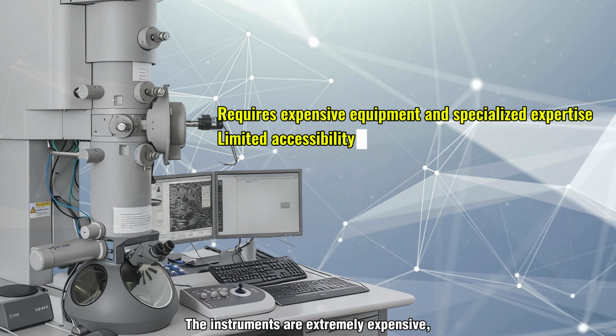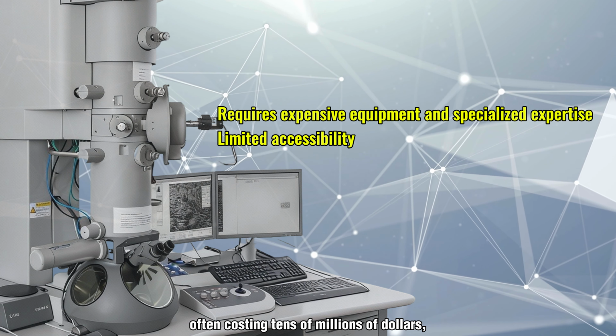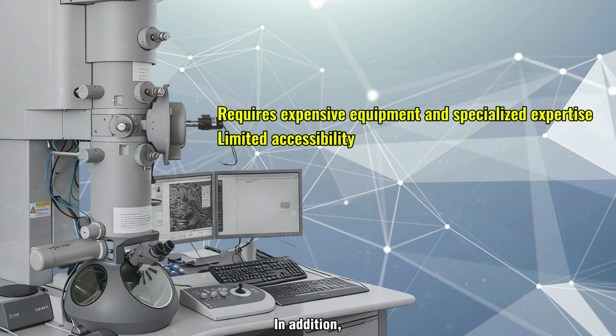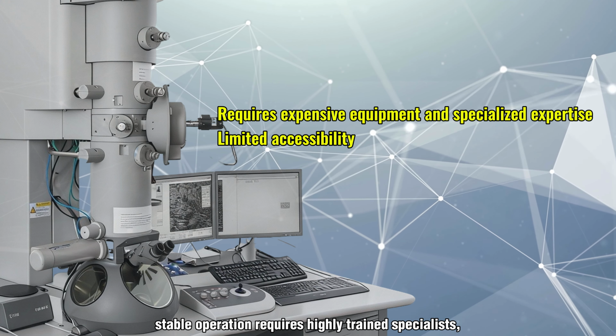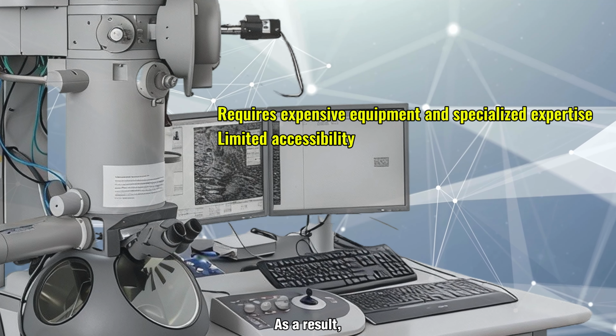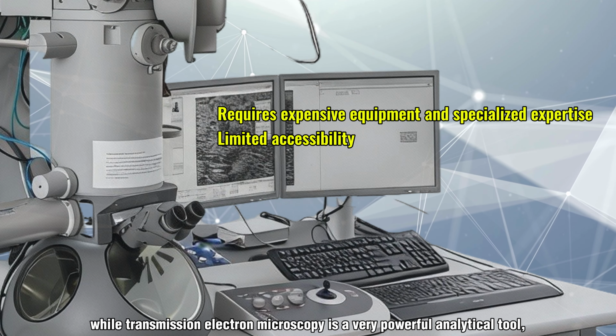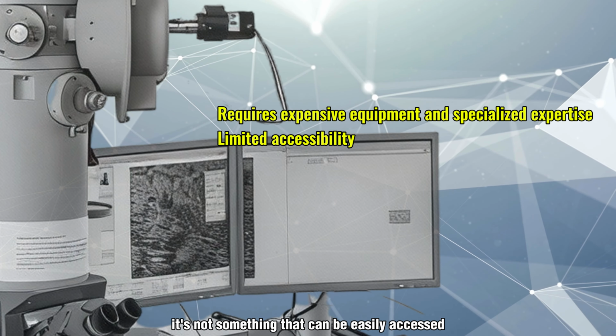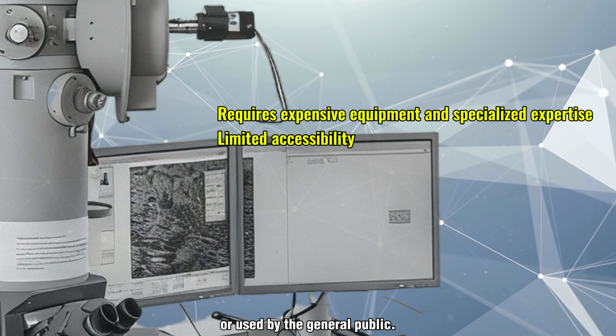The instruments are extremely expensive, often costing tens of millions of dollars, and in some cases even more. In addition, stable operation requires highly trained specialists, typically at the graduate level or above. As a result, while transmission electron microscopy is a very powerful analytical tool, it's not something that can be easily accessed or used by the general public.